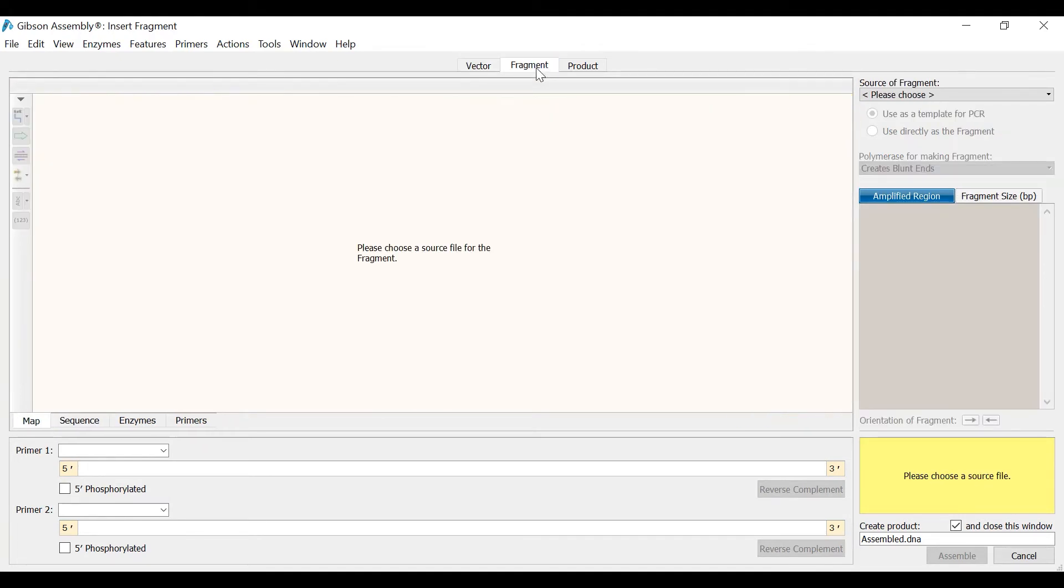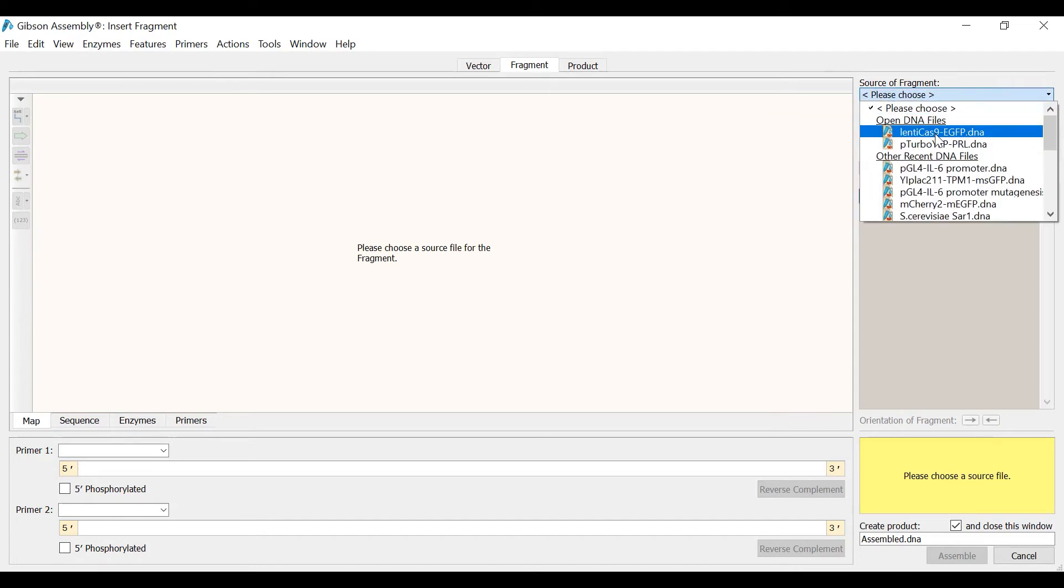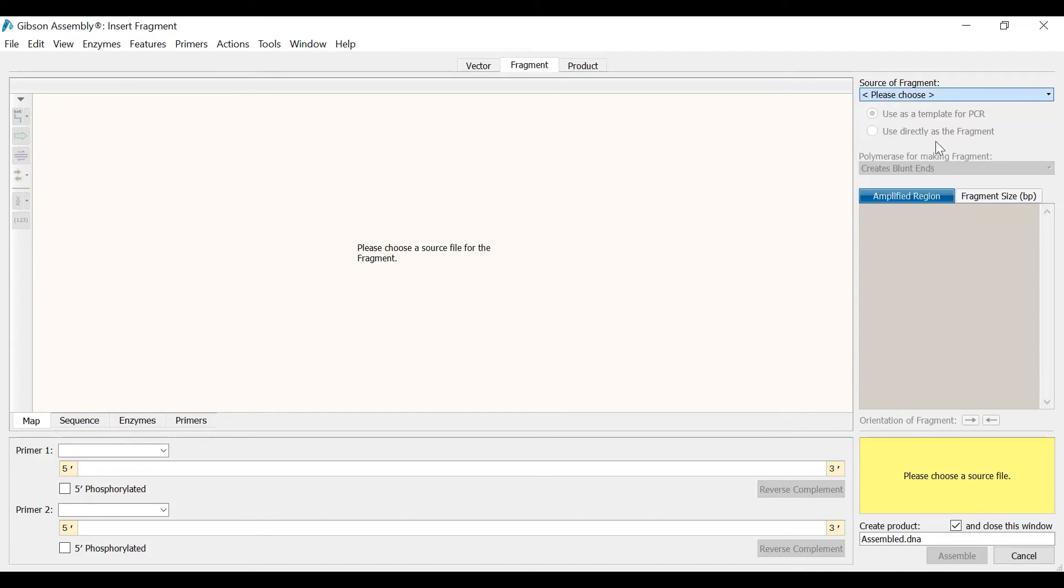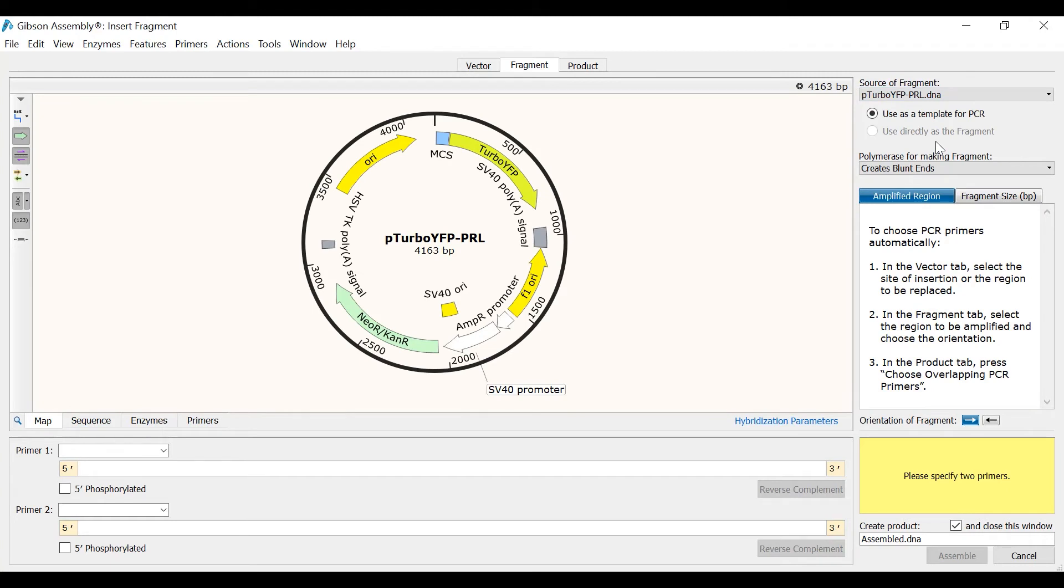Then I will use the dropdown menu to the right to select the file containing my fragment of interest. In this case the file is the Turbo YFP reporter. Next I will select the fragment that I want to insert. This will be the Turbo YFP feature, so I will select this.